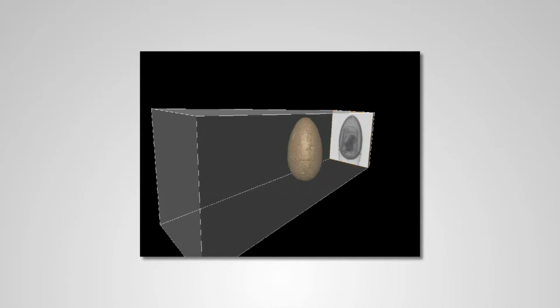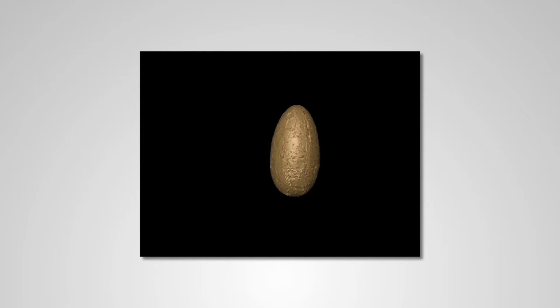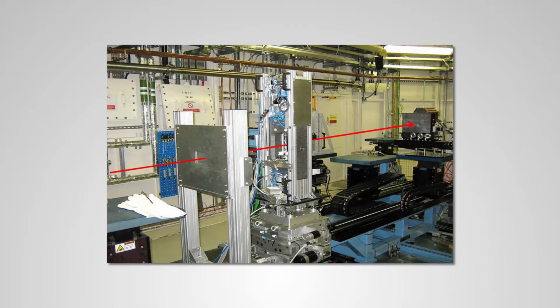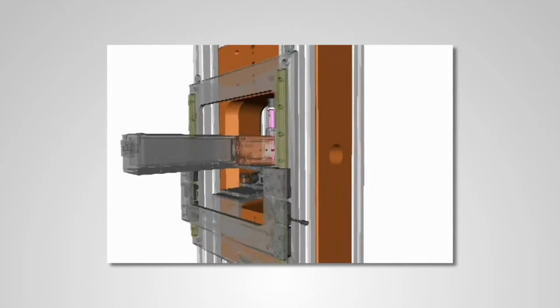The different components within the material show with different contrast, just like when you have a medical X-ray. Using computer techniques, we can then reconstruct these projections into a full 3D representation of the object, much like a medical CT scanner. With our specially constructed experimental rigs, we can heat, cool, squash or twist the object as we take the measurements, and then look at these changes through time to probe the science in 4D.